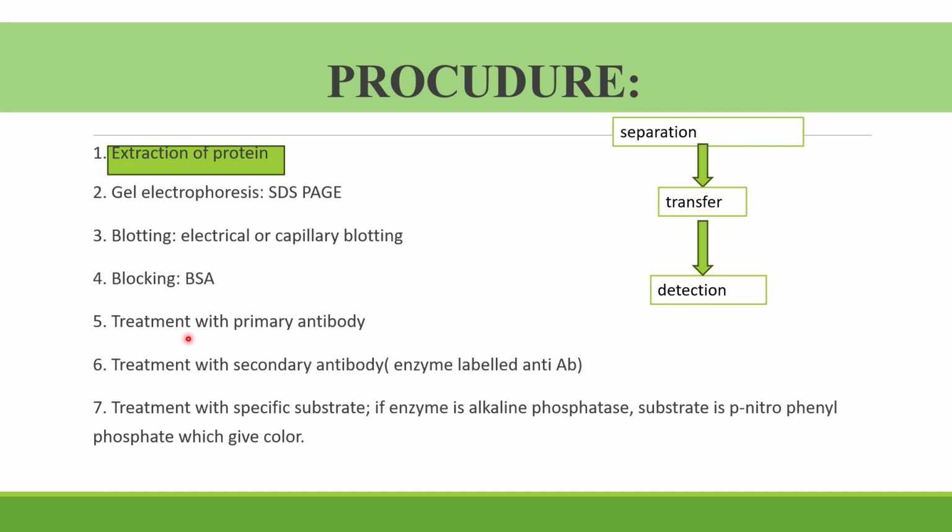So you have to treat with primary antibody, which will last approximately 8 to 12 hours. That is more than enough. After that you have to go for washing. Half an hour of washing, at 5 minute intervals. You cannot wash it with normal water. You have to make PBST. Similarly, the primary antibody should be made in 3% BSA, and that BSA should be made in PBST.